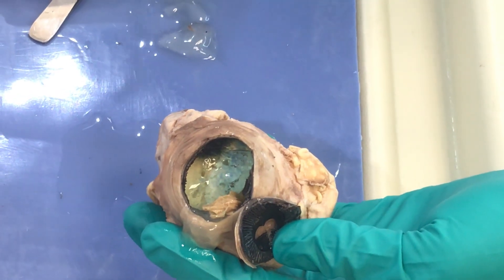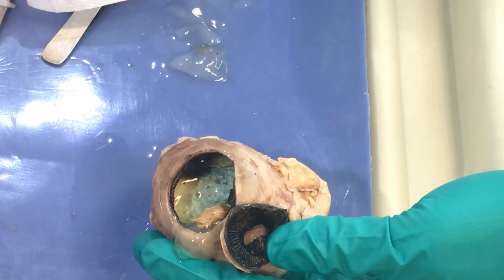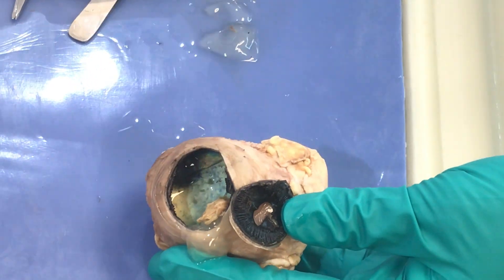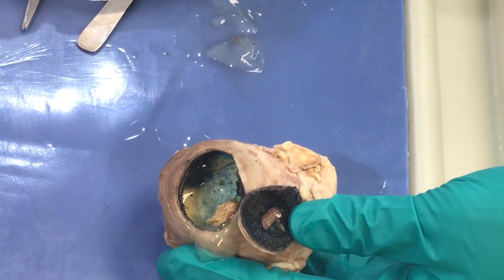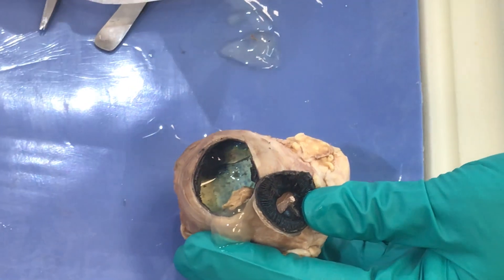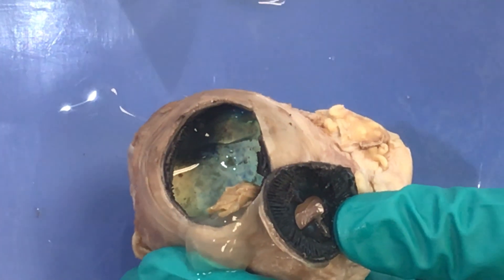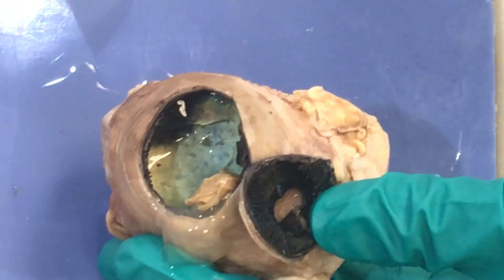The tapetum lucidum is not in humans. This area is highly refractive and allows many animals to see at night — most mammals have this. This is why when we take flash photography we get red eye: we do not have this, so we see the vessels of the choroid reflecting back. When you take a picture of your cat or dog and get a green or yellow glow, you are seeing the tapetum lucidum, which refracts light and improves night vision.